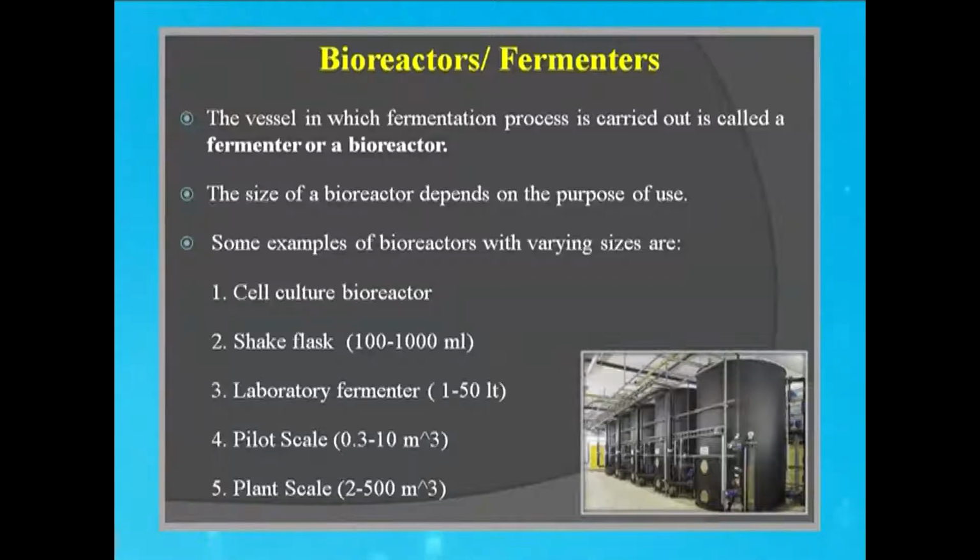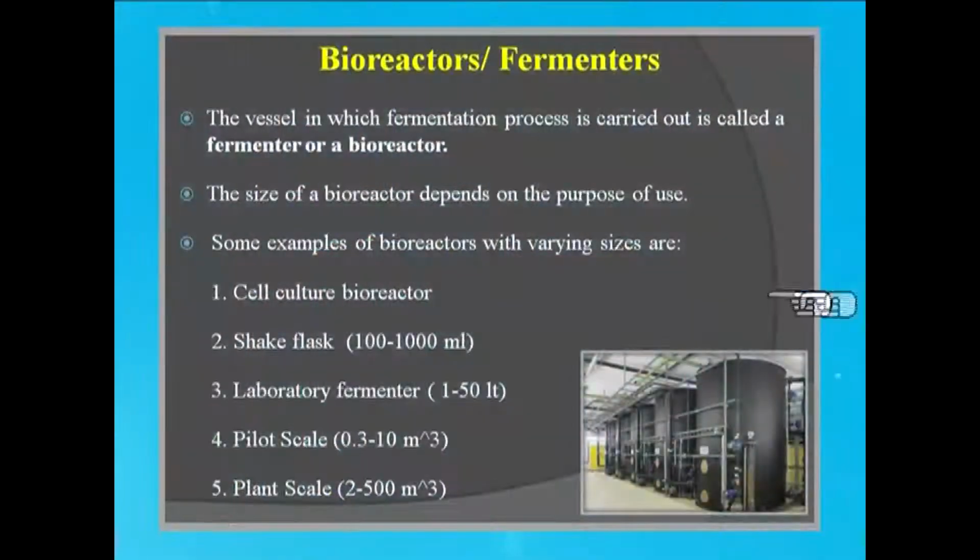The sizes of fermenter vary depending on the need, and we can see there are several in line. Firstly, the cell culture bioreactor, very small in size. Then we have shake flasks, again small in size, followed by laboratory fermenters and the pilot scale, and finally the plant scale bioreactors. Let us quickly see how they look.